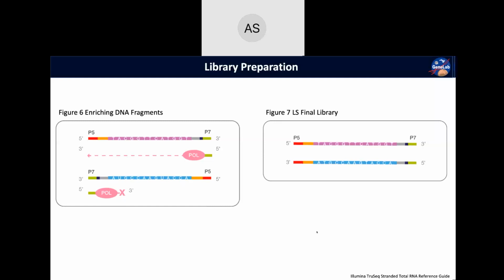Great question. So remember, when we are doing the sequencing, ultimately we want to know how much starting material of each gene there was, if we're looking at gene expression, which is what we're going to do. We want to know how much of each starting material was in our original samples, right? And so we want to make sure that we are not artificially increasing the number of copies of any gene. Of course, you run that risk when you do this PCR step, because you are purposefully amplifying the material that's there.